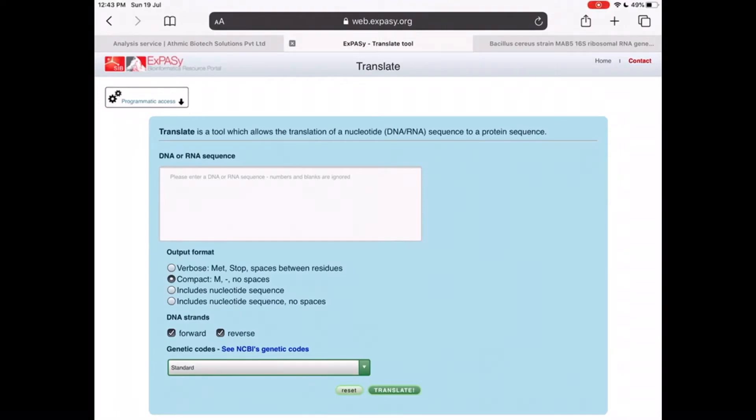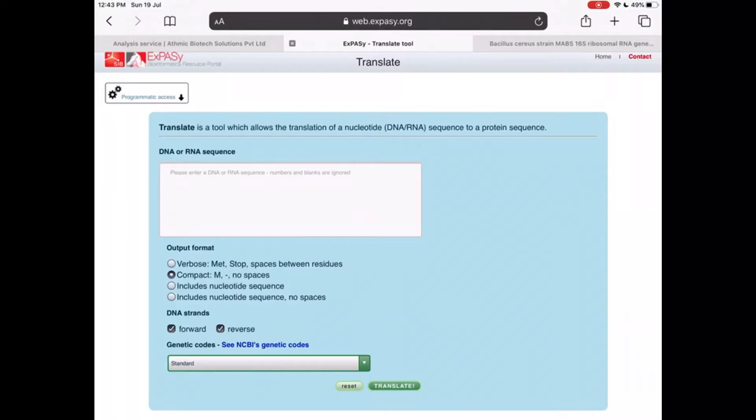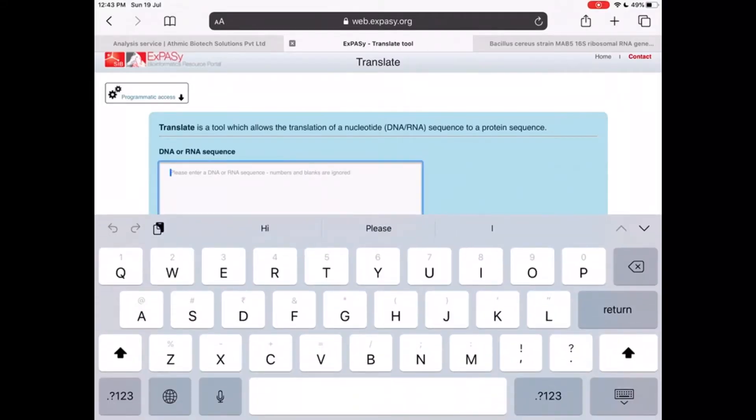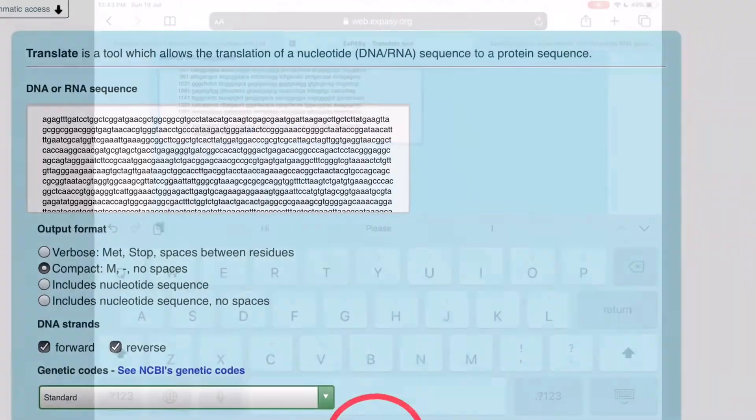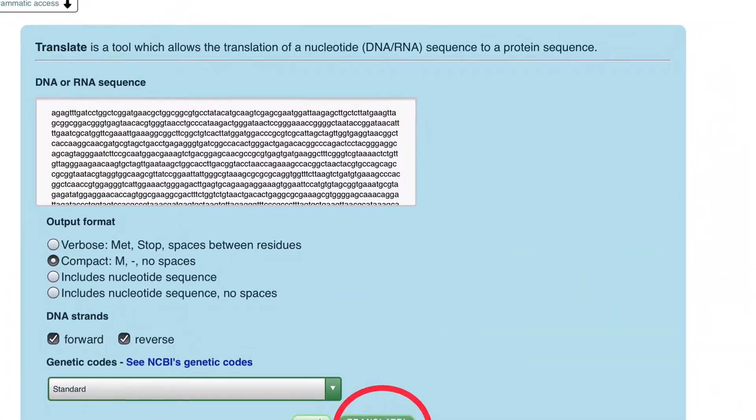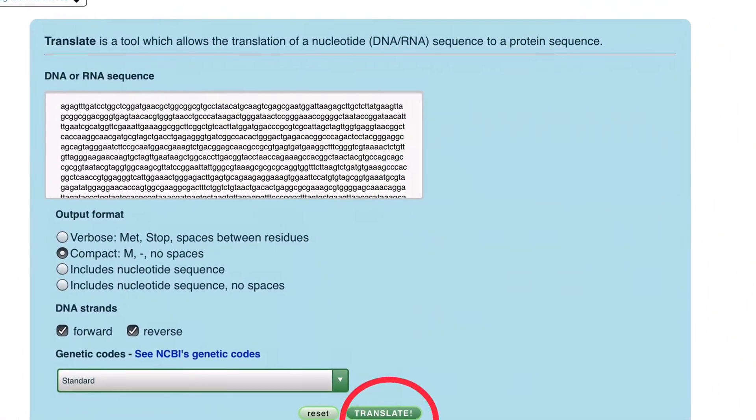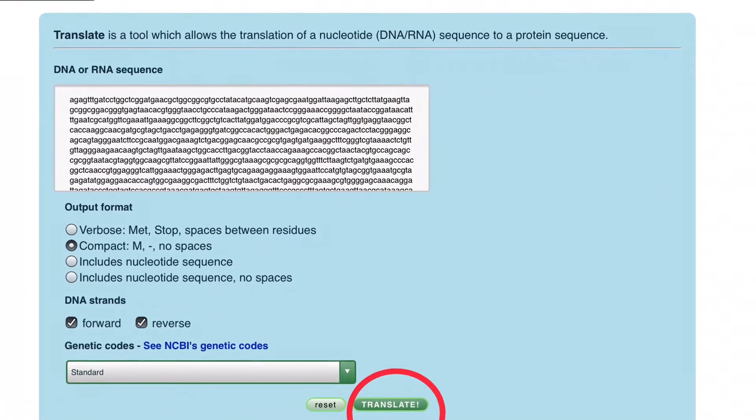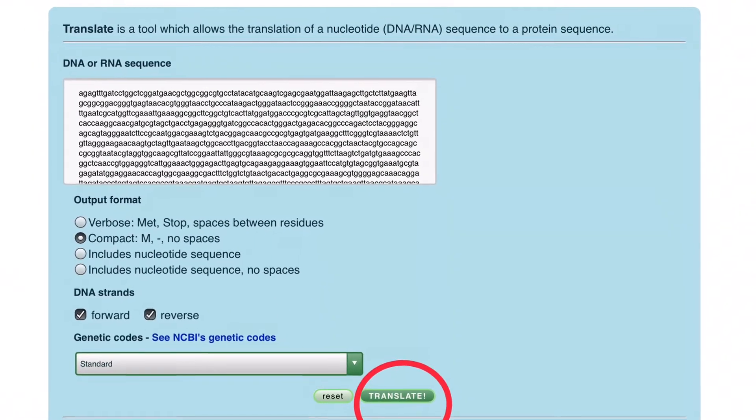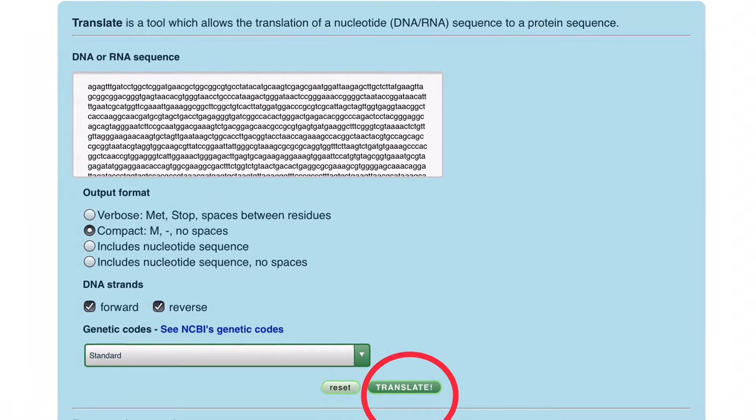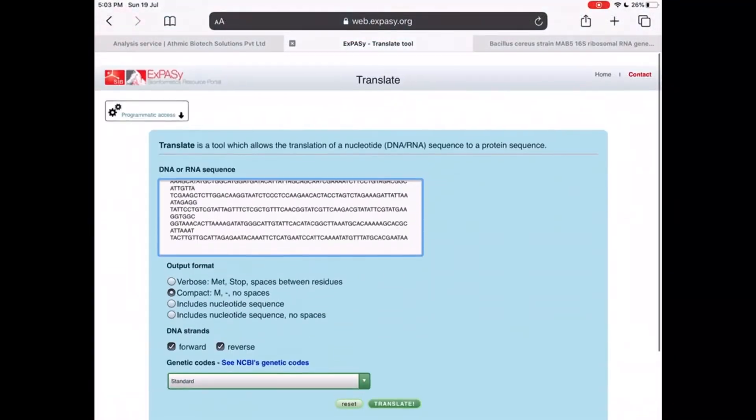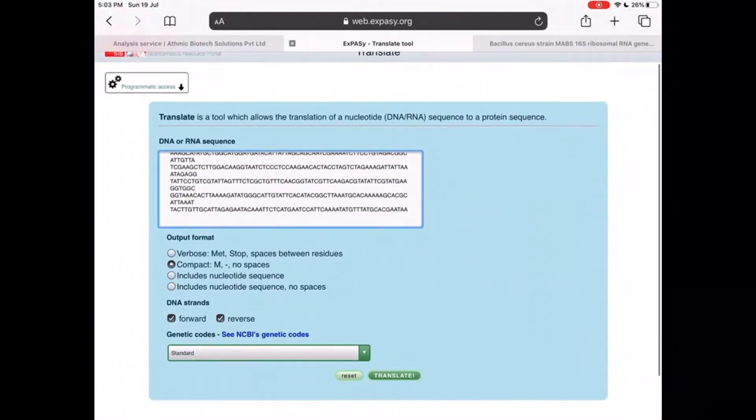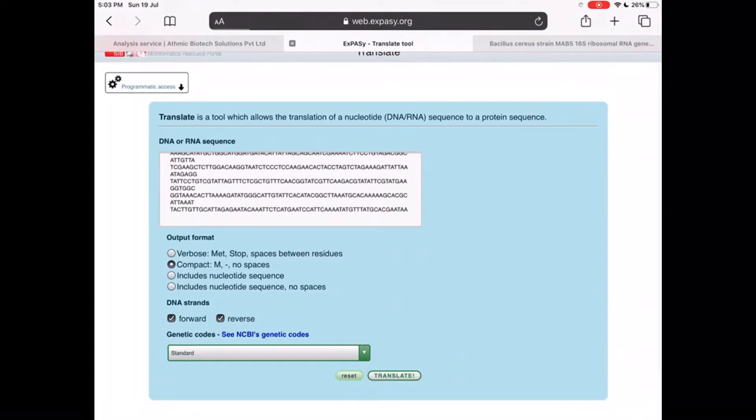There will be a box inside that you can copy paste your DNA or RNA sequence. At the bottom you can see a button called Translate. Click on that. You will get the amino acid sequence.